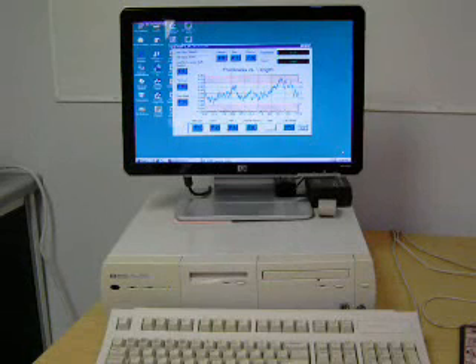The Oakland Instruments Series MX-1210, MX-1200, and MX-1100 micro gauge thickness testers are designed to meet the testing requirements of ASTM D6988, Standard Guide for Determination of Thickness of Plastic Film, and TAPPI T411, Thickness of Paper, Paperboard, and Combined Board.